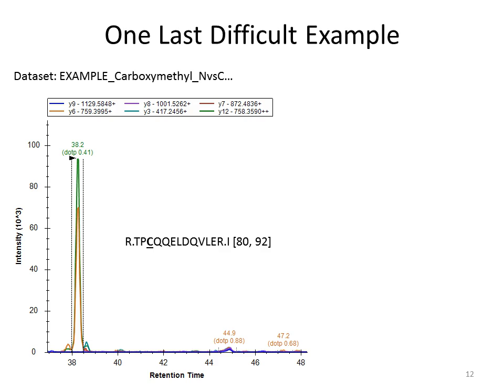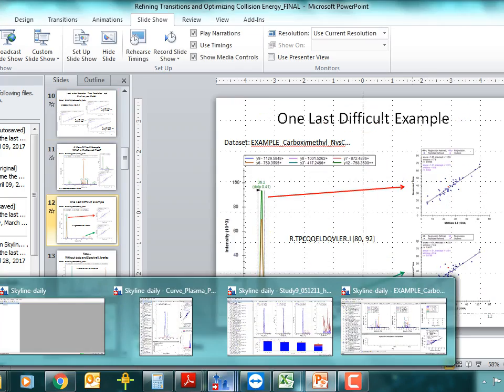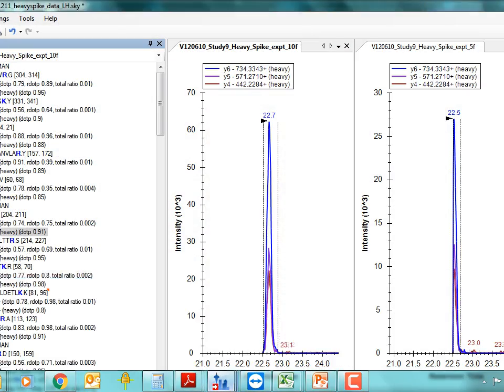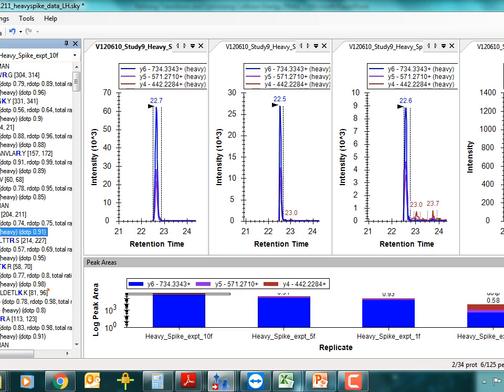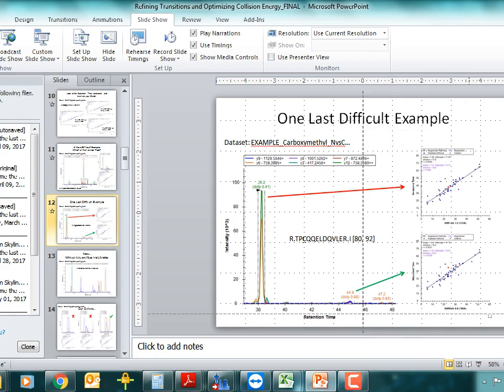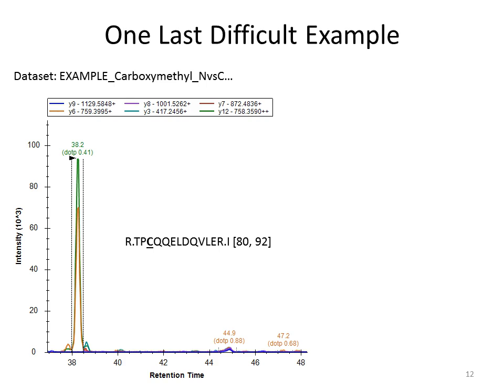Sue had mentioned the little icons next to the peptide sequences in the target list. If next to that there's not those three big lines, so like really reduced, these little guys, the representation of a spectra, you click on those, you should be able to see the dot product listed next to it. And if you want to look at the spectral library for that, I think it's under View. You can look at Spectral Match. You can bring up that window. You can see the library.